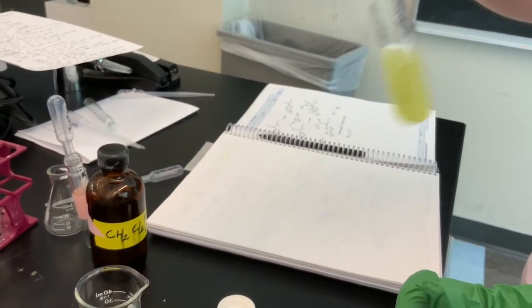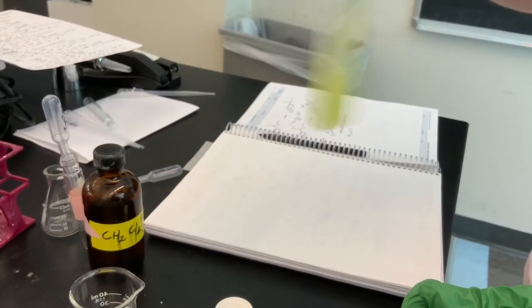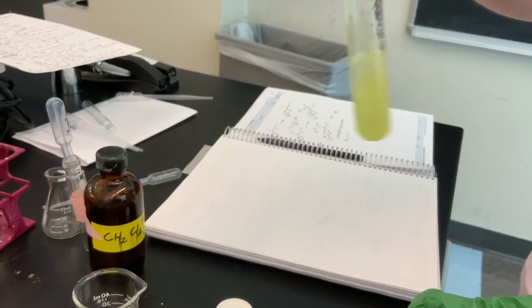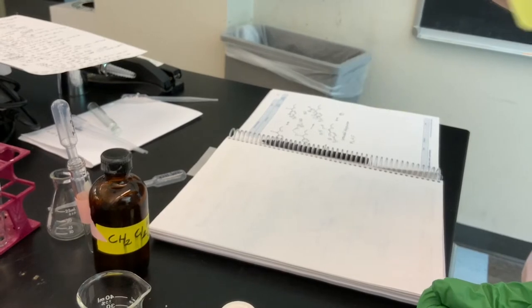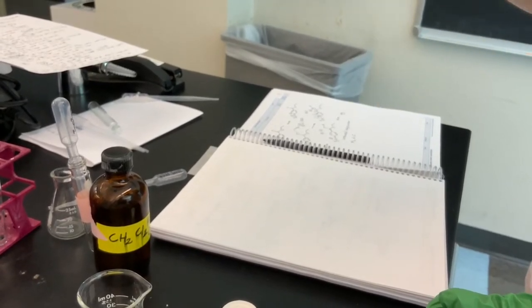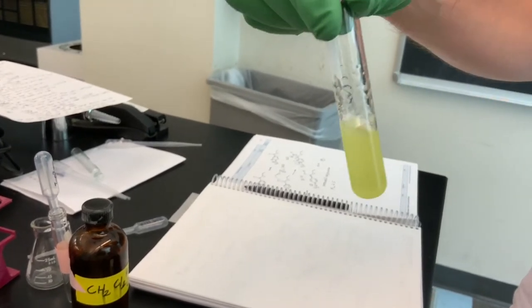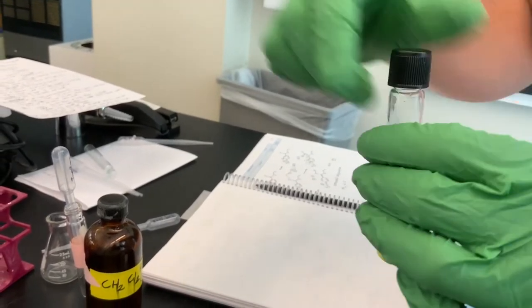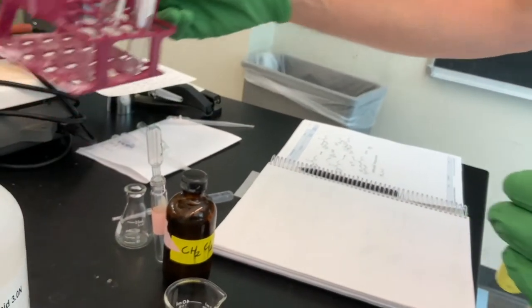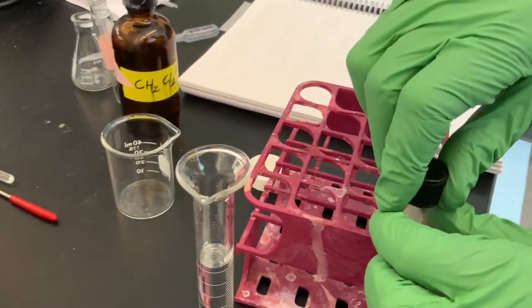So remember, what now is happening is that I'm of course trying to mix the two layers as best as I can, but eventually they'll still separate once I stop agitating the culture tube. But what's going on in there is that in the aqueous layer, the benzocaine is being protonated. It is now the salt, protonated benzocaine, and it's going to be more soluble in the top aqueous layer. So what we're doing is we're moving it from the lower organic layer. That's the idea there, and this is just, again, emphasizing how important it is to understand your acid-base chemistry.